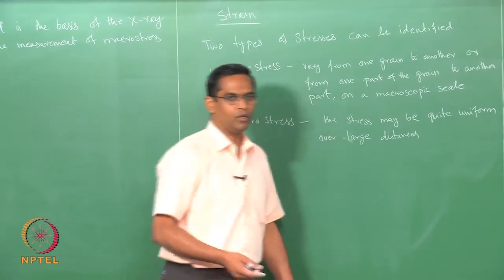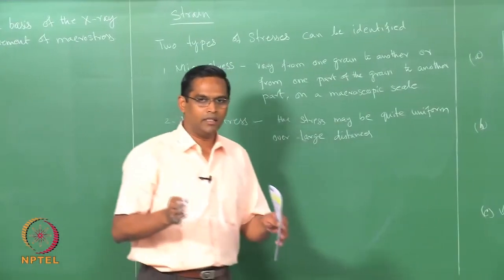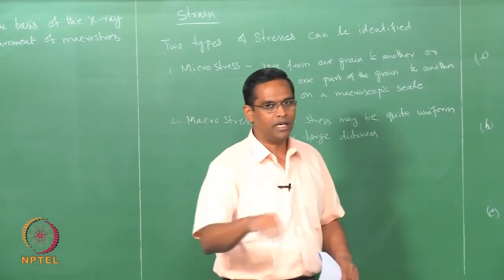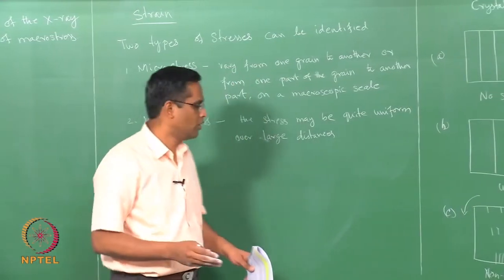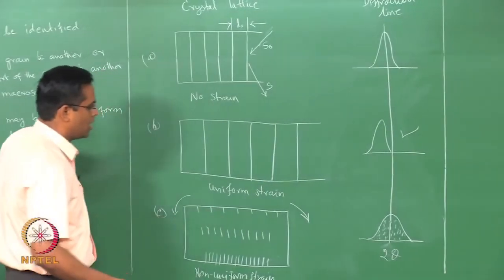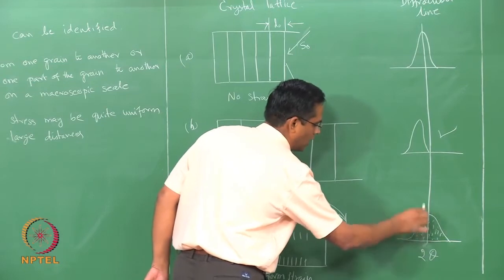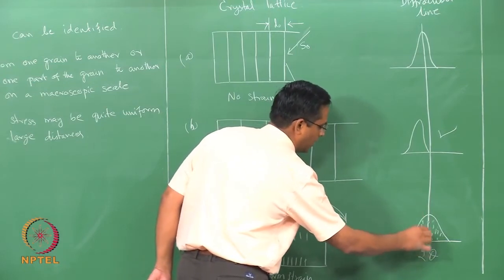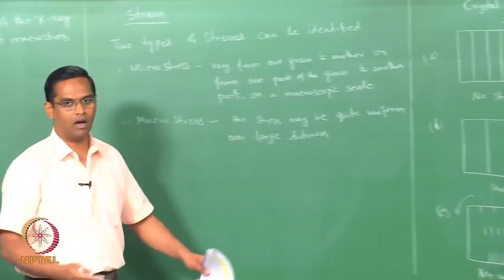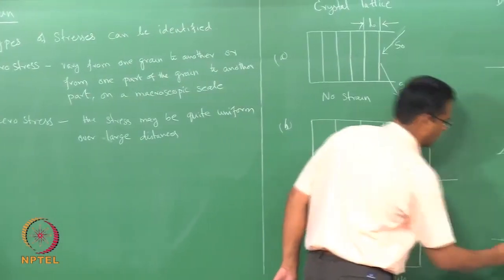Because of that, you will have a region in a grain where the d spacing is constant for some region with respect to the neighboring region within the grain itself. So, because of that kind of a situation, each one of these peaks will produce a small sharp peak inside, which eventually we observe or record as a broad intensity peak.